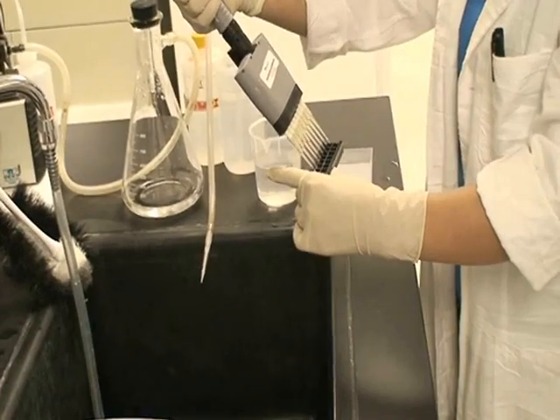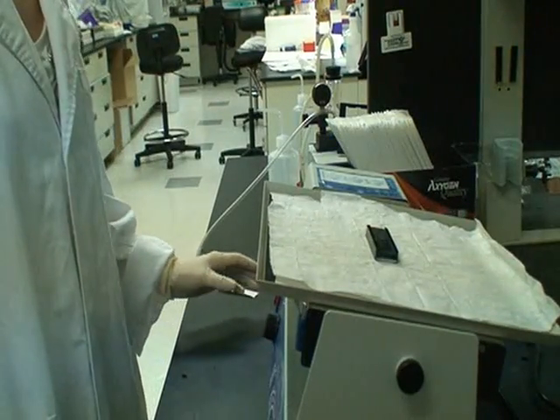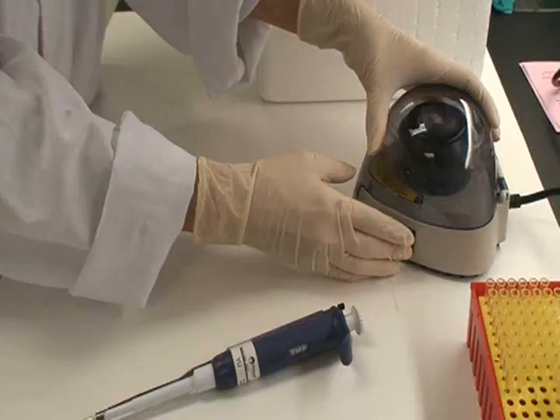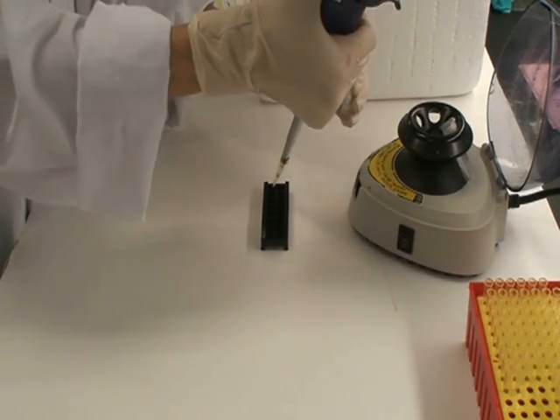Then add 150 microliters of wash buffer 1 and shake gently for 5 minutes. Be sure to completely remove the wash buffer from the wells after each wash step. Add 80 microliters of detection antibody cocktail to each well and incubate for 1 to 2 hours.